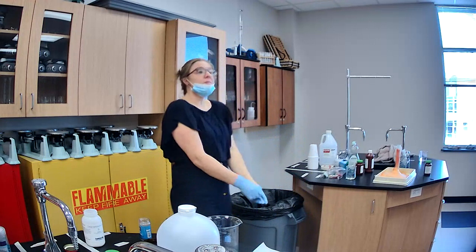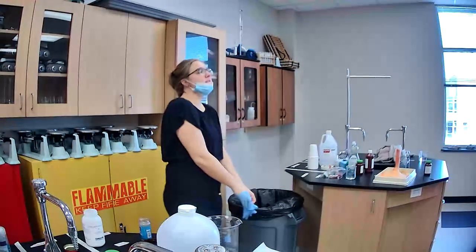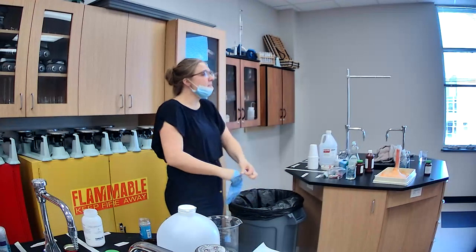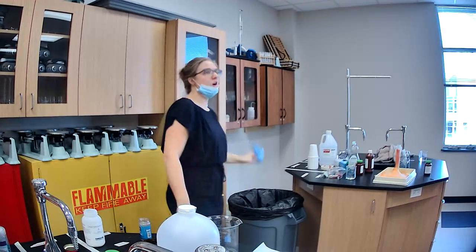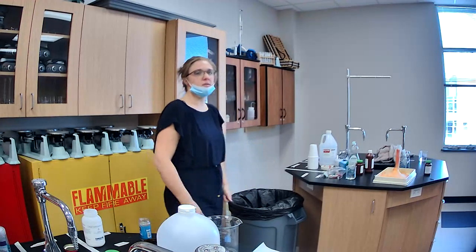Okay, so that's the melting foam. The polystyrene dissolves, and the little air pockets that are trapped in there begin to escape. It'll cause the bubbling, and all that's left behind is the little goo.